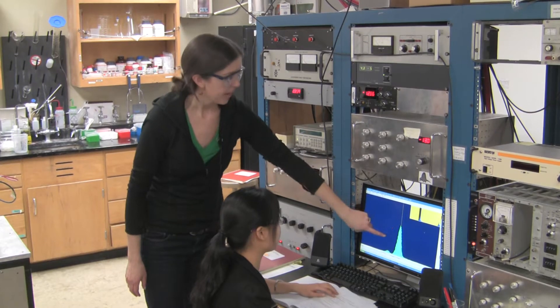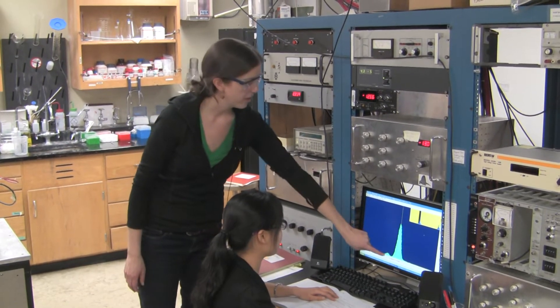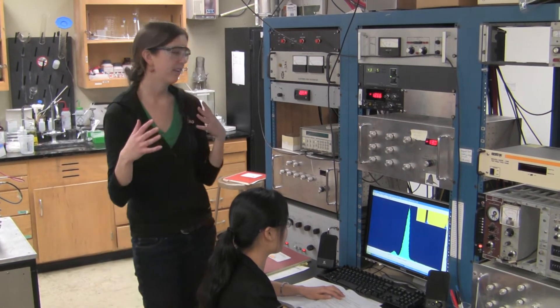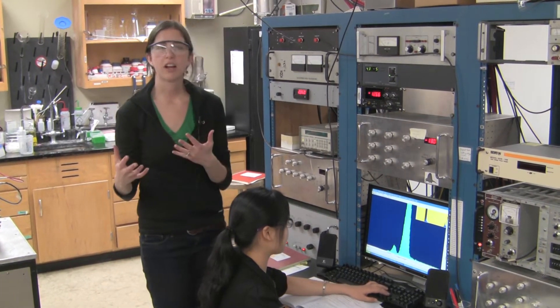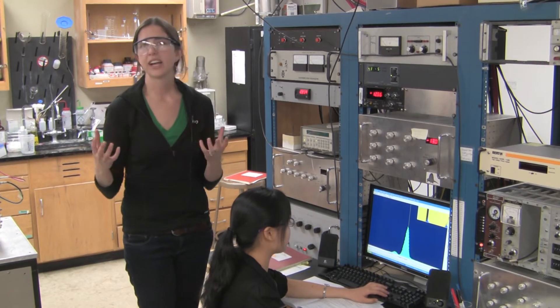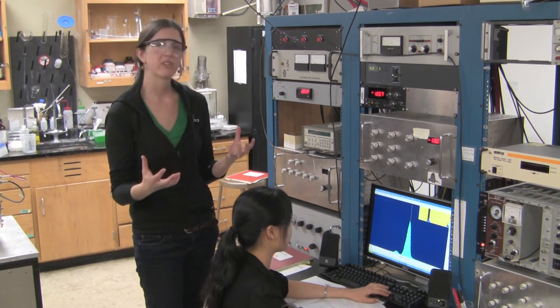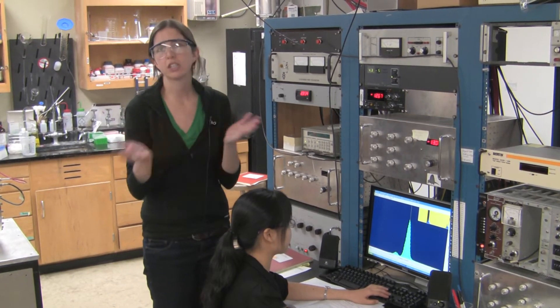One on the right is a smaller aggregate and one on the left is a larger aggregate. In Alzheimer's disease, like many other neurological diseases, it involves aggregating proteins, proteins that form different sized aggregates. In our mass spectrometry experiment these aggregates would all show up in the same place.